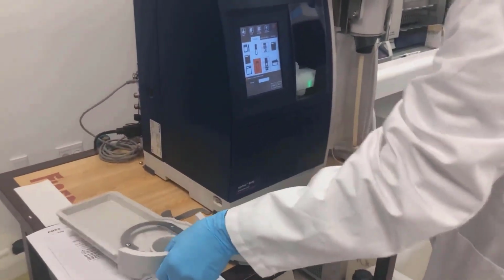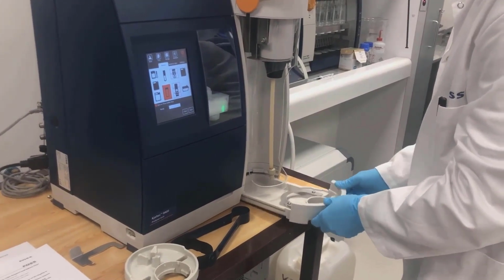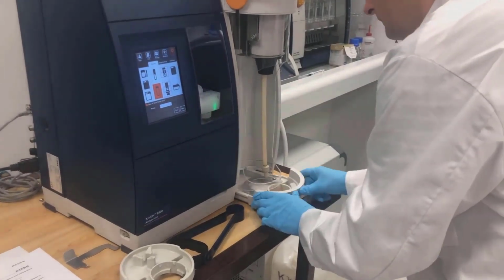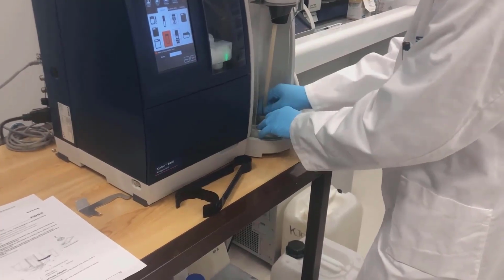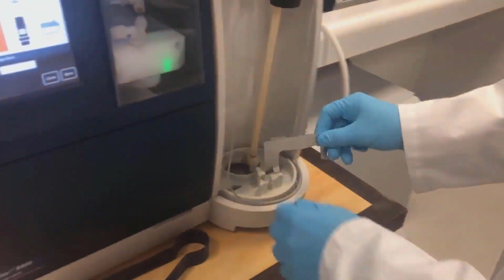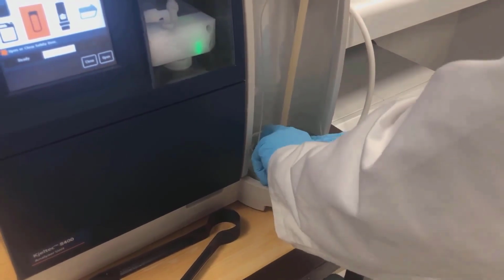Then next you will take the drip tray back and insert it. Then it's the tube support. And you have to put this small metal piece back to fix the tube support.